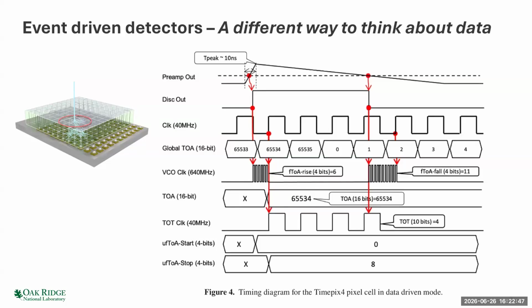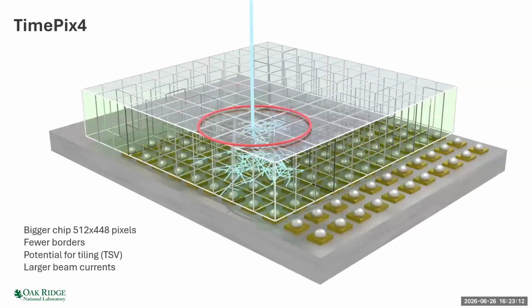So you have to play quite a lot of tricks if you want to get much faster than the base clock speed, which is 40 megahertz in this case. There are basically very clever ways which make the data, of course, way more complicated. So you then have to figure out how to decode it. So just to get this data stream out and to get to an image is quite an ordeal.